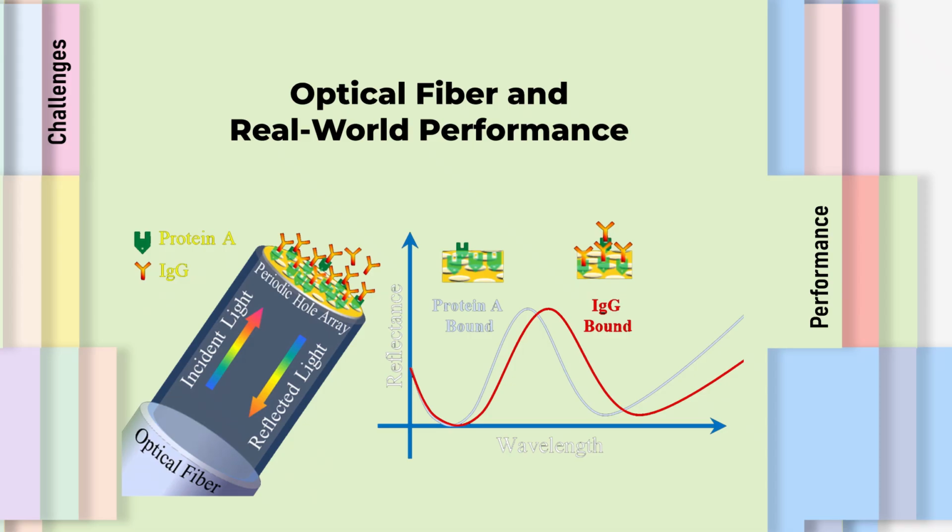When light travels through the fiber, most of it stays inside the core, but the evanescent wave extends into the cladding region. If the cladding is modified with plasmonic materials, the evanescent wave can excite plasmons. Changes in the sensing medium then change the resonance condition, which allows analyte detection. Recent optical biosensors show detection limits ranging from picomolar to millimolar levels. These detection limits demonstrate that optical biosensors can achieve very high sensitivity in real applications.